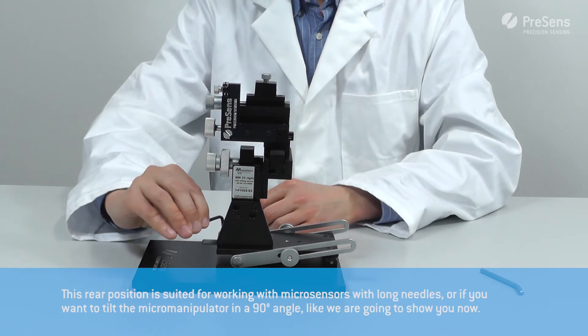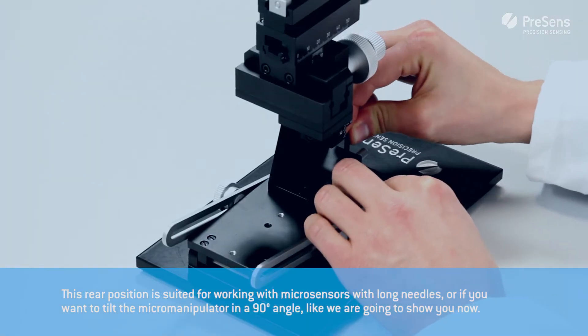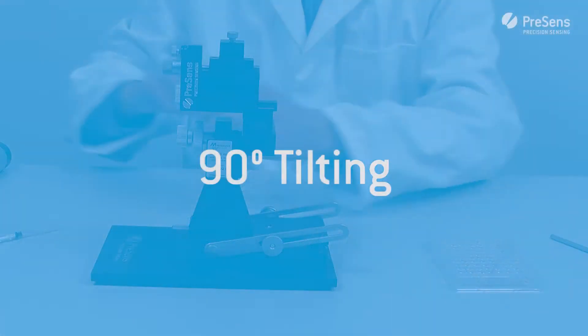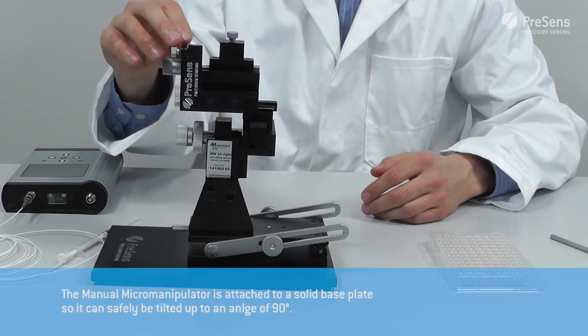This rear position is suited for working with micro sensors with long needles, or in case you want to tilt the micromanipulator to a 90-degree angle like we are going to show you now. The manual micromanipulator is attached to a solid base plate so it can safely be tilted up to an angle of 90 degrees.